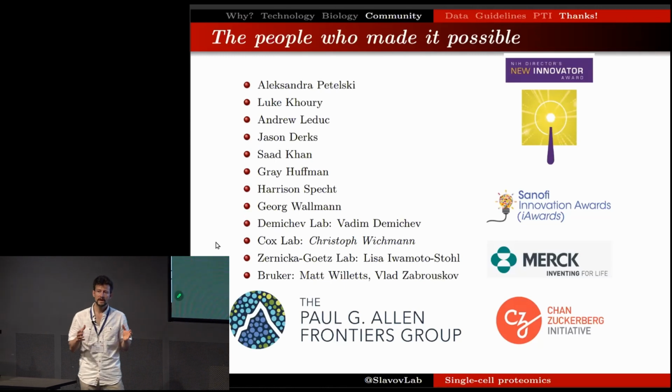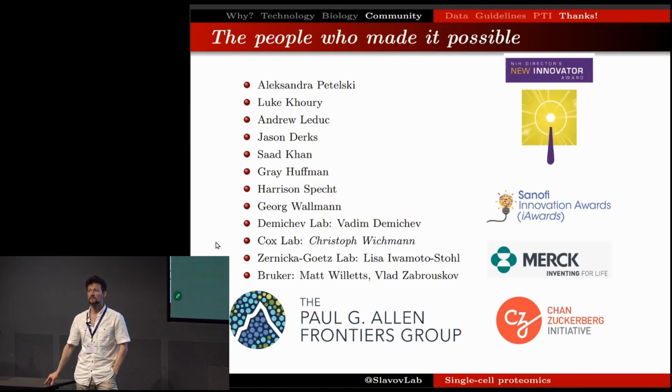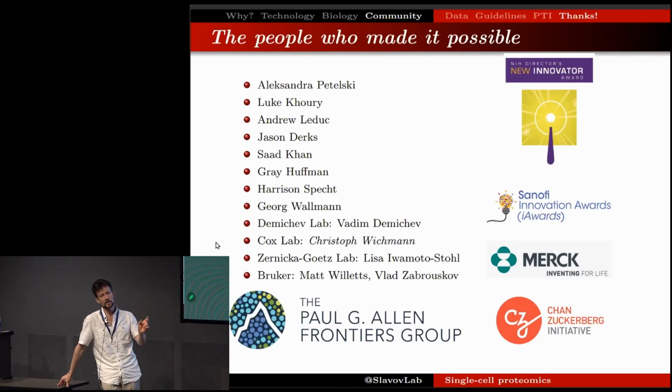But in general, we have seen that the first tier can have 2,000 to 3,000 precursors without this having any adverse effect on data completeness. So the number of proteins that can be prioritized is quite large with that number of precursors. But the criteria for that can be anything that you desire. On the technical level, one thing that is a bit of a limitation, to the extent that we're using data-dependent acquisition with narrow windows, is if there are some precursors that are going to be always co-isolated substantially with another precursor, that's a limitation for any DDA approach.